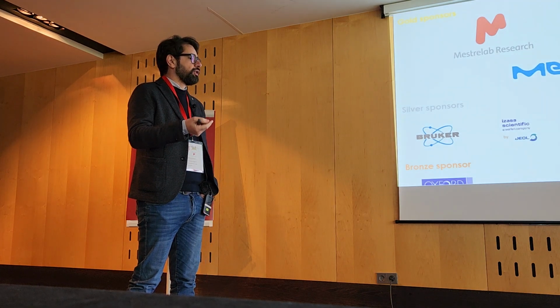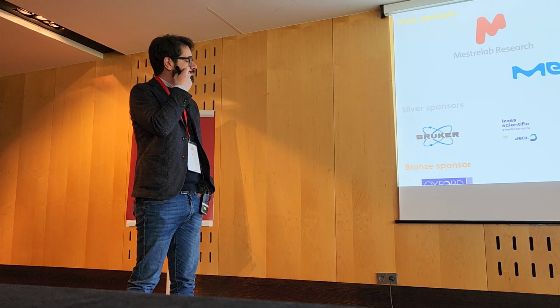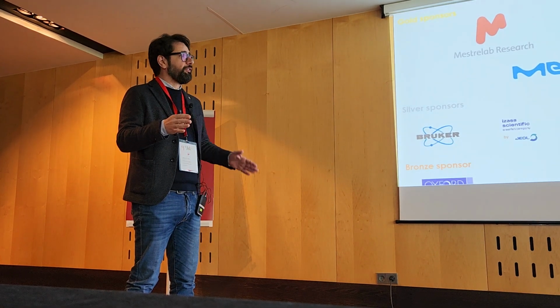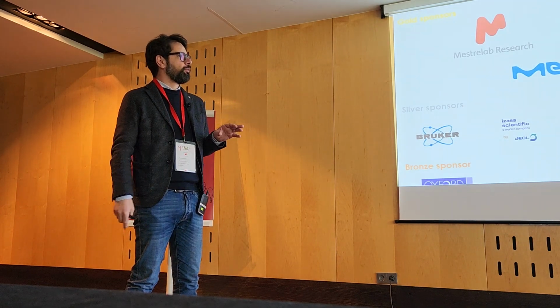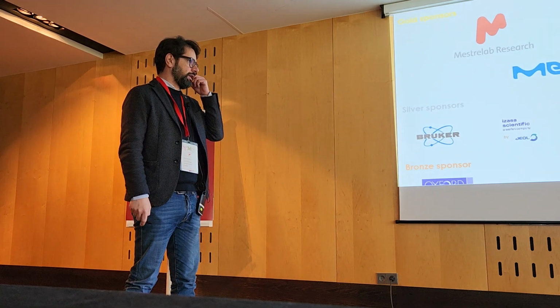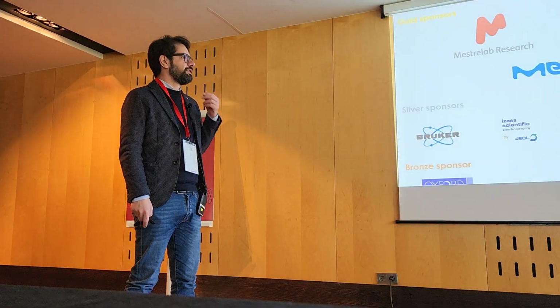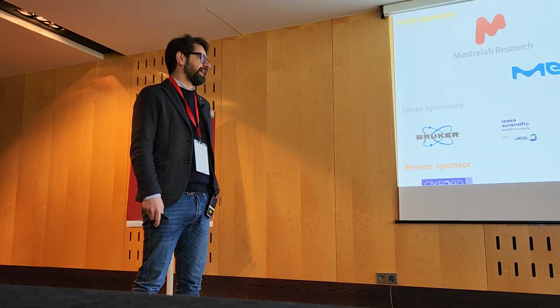We created automation in the sample preparation and in the calculation after integration. But before integration of the signal, we are now working with manual work. Hopefully, if we replace human operators with software, it should be very nice.